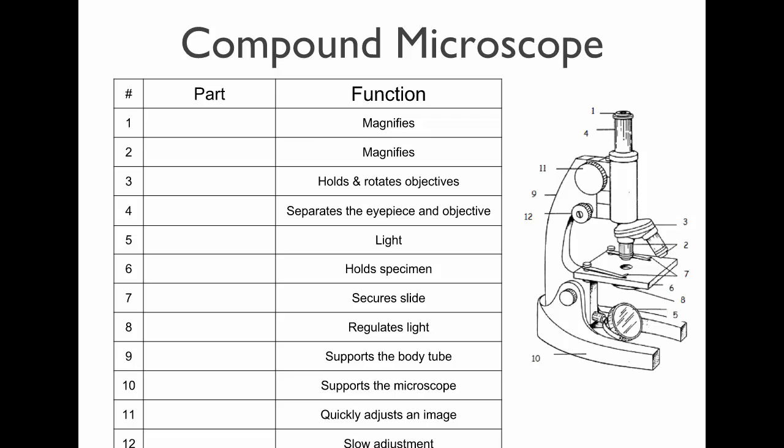All right, so let's talk about the parts of the compound microscope. Next week, towards the end of the week, we'll be having a quiz on microscopes. One of the things you have to know is what these parts all do and what they're called. So I have a little diagram here, and I'll show you on the actual microscope.